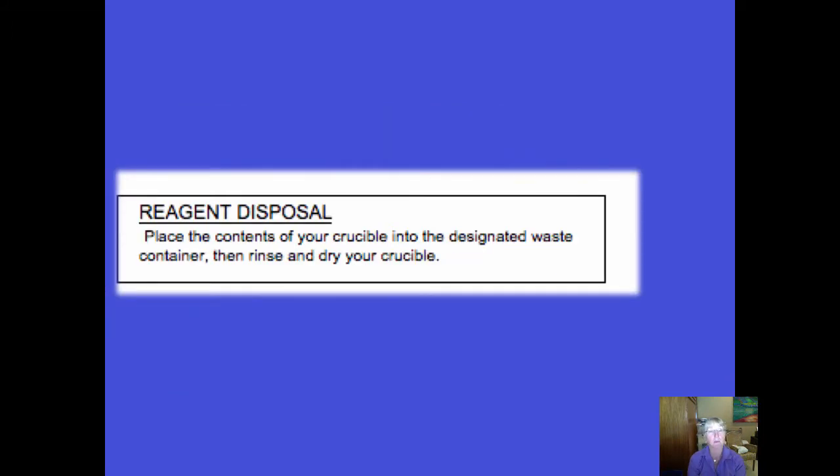The reagent disposal, to repeat. You will scrape all of your hydrates, now anhydrous, into the trash can except not number 4. But for all 5 types, you now go to a sink and use the scratchy side of your sponge to scrub the inside of that thing clean after you've scraped out the solid with your spatula into the trash.